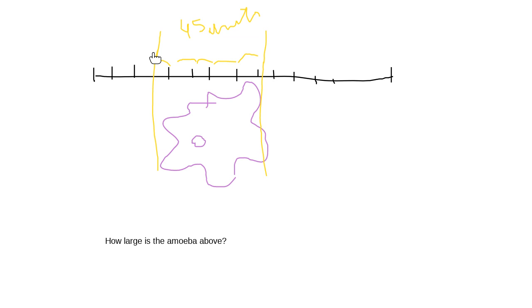And the reason why you don't know is that I showed just 45 units, but I didn't tell you how large the units are, so I cannot tell it in micrometers. And for me to know that, I need to know what objective I am using. Because remember, the number of micrometers for each of these units depends on which objective you are using.